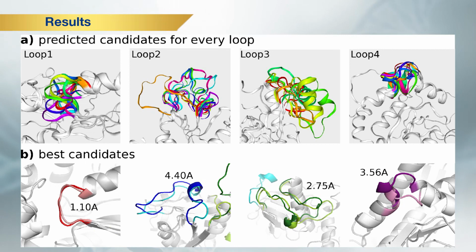Among them, as the analyst, we can select any significant loop model, and it may be selected to see the root mean square deviation as well. On the basis of that, fittings and flanks can be reported. For each loop, the results will be represented and the best possible candidate will be shown. This may also be represented by different figures, as we can see in the presentation, where the root mean square deviation, flanked regions and loop models are reported.